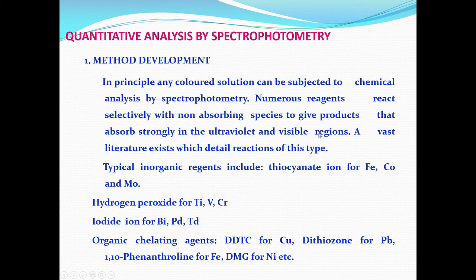Now, we go looking for what to do with a spectrophotometer. Given a spectrophotometer, what all you can do with it is important. First thing is to find out the unknown concentration, that is number one. You can do monitoring of an effluent or something like that.